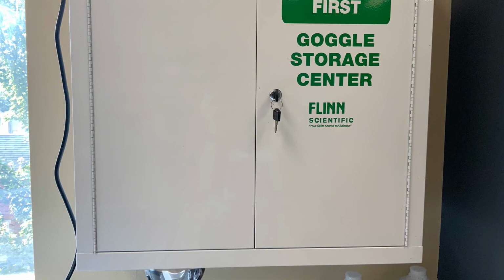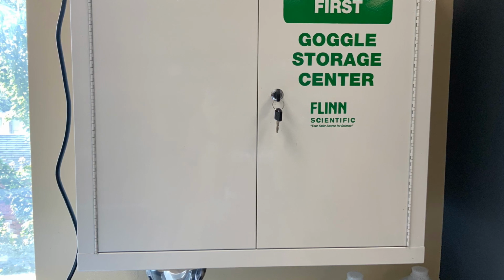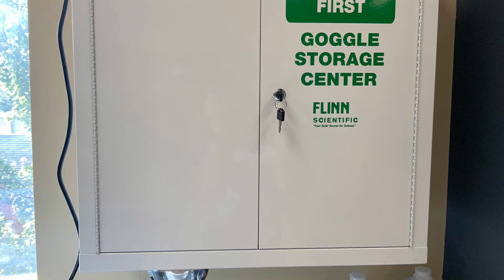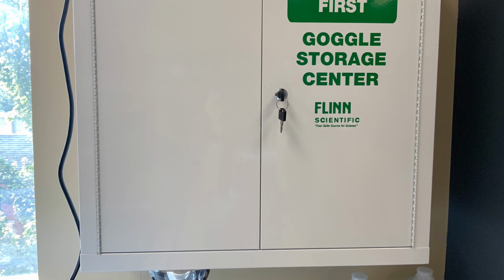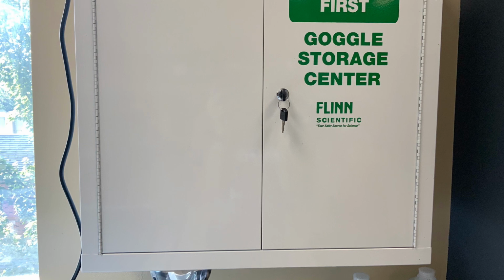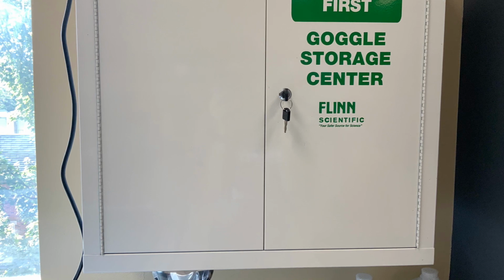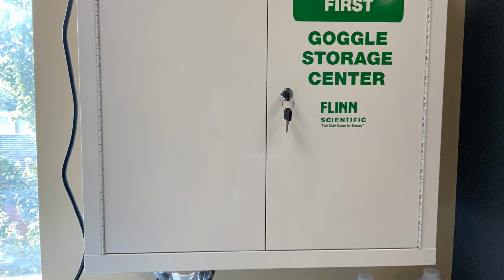Up next, we have the lab goggles cabinet. Now, the photo that I have of it is closed, but if you were to open it up, there'd be, let's say, roughly 30 different pairs of lab goggles. These are used to protect your eyes during any experiments, to make sure that no chemicals come up and that the chemical eye wash station doesn't have to be used. So that's where all the lab goggles are stored. Once an experiment starts, you grab a pair. Once you're finished, you put them back where you got them.